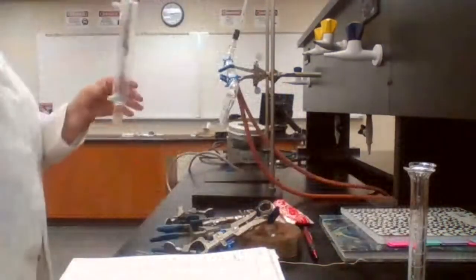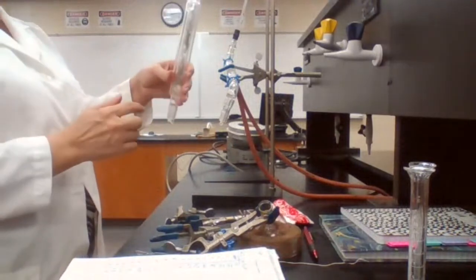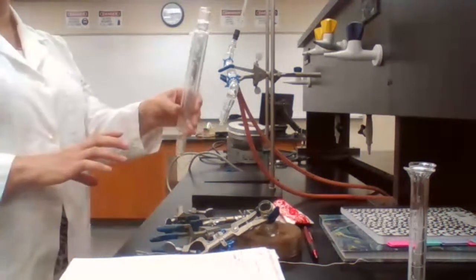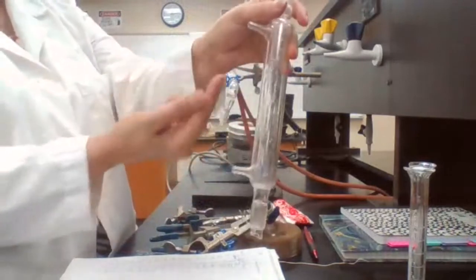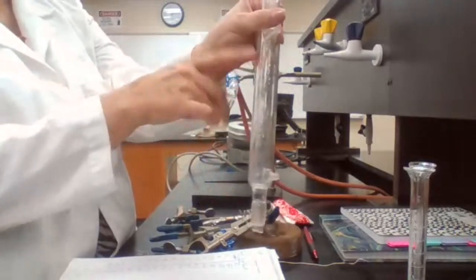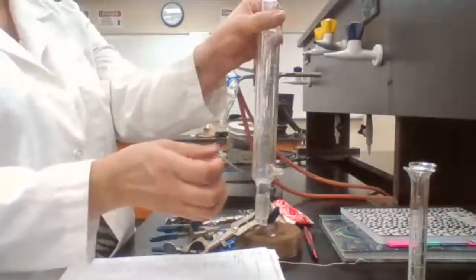So now I'll show you how to assemble the fractional distillation. The only difference between fractional distillation and simple distillation is the addition of the fractionating column. How clearly you could see from there, I don't know, but there is steel wool inside this condenser that is acting like a fractionating column together with the condenser.